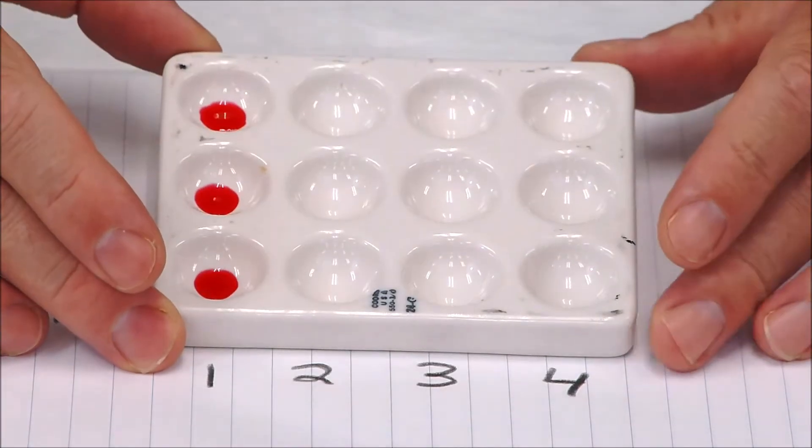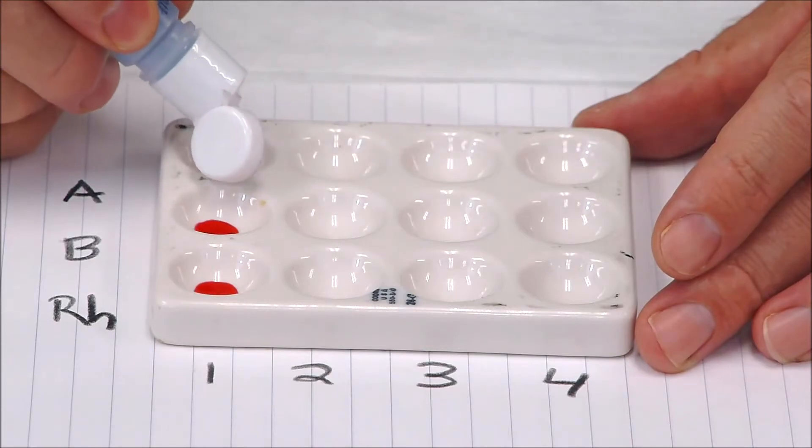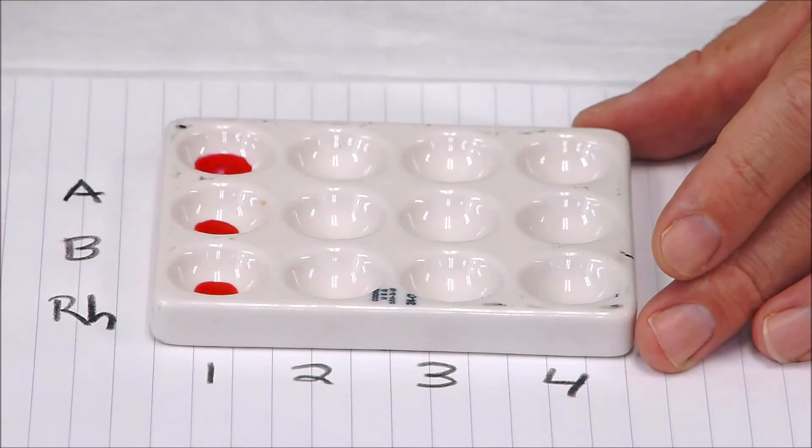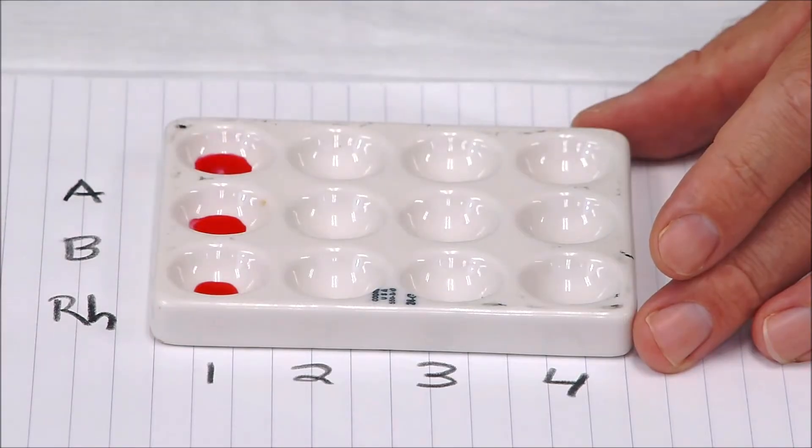You can see the blood analog is sitting in there. Now to the first well, I'm going to add anti-serum A—this is essentially adding an antibody to it, so one drop is enough. Then to the B, I'm going to add B, and to the Rh, I'm going to add the anti-Rh or anti-D.